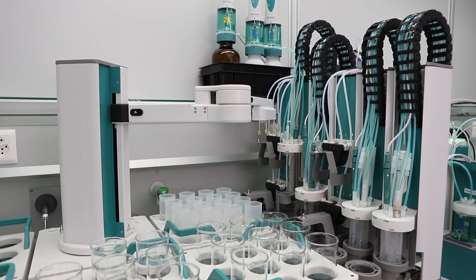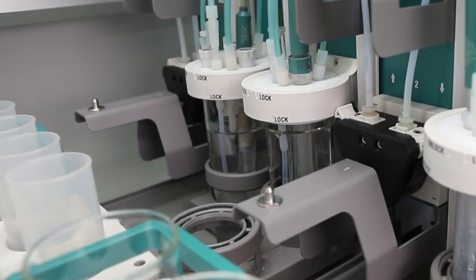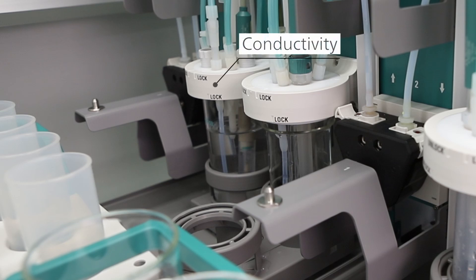The conductivity cell is dipped three times into the sample for preconditioning. The conductivity is then measured.